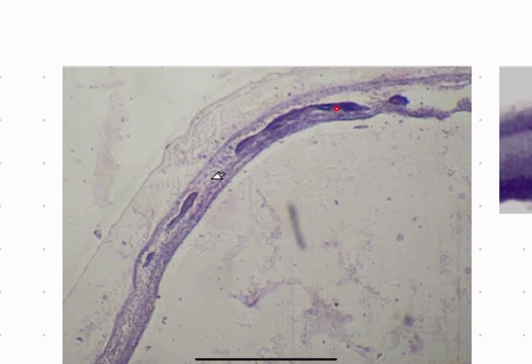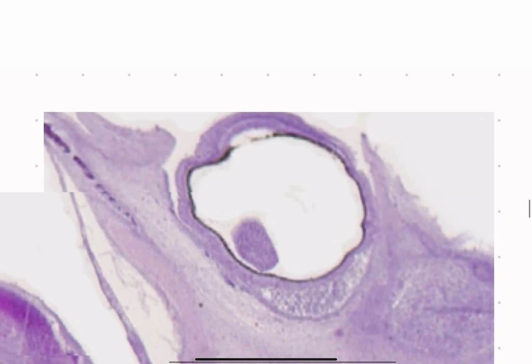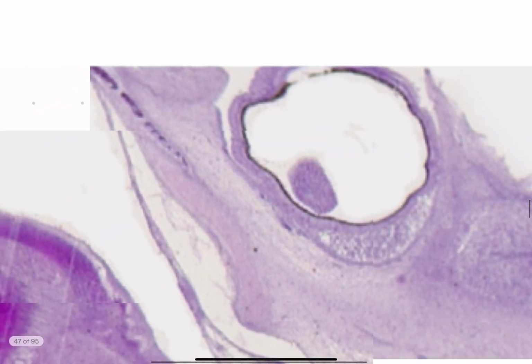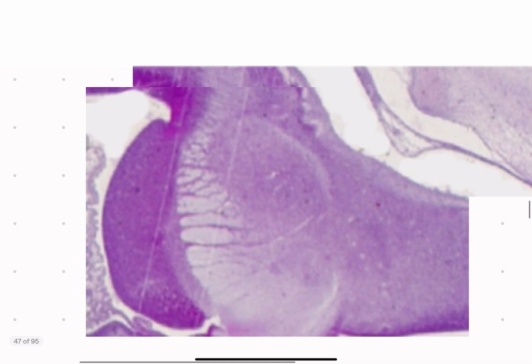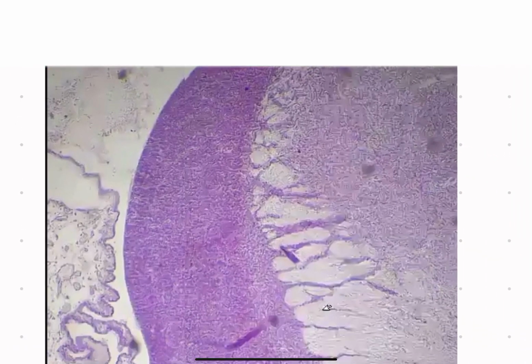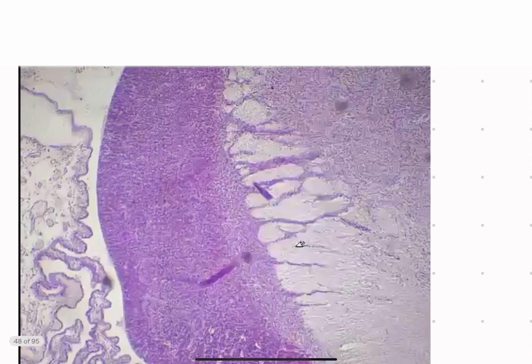Don't forget to write in the slide name as well. All right, moving on to the next slide. We're within the same area. And then we move towards the bottom left, so same slide. And we zoom into that general structure. See something like this. So for here, I'd like you guys to write down the name of this structure. And also the slide name will be the same as before.